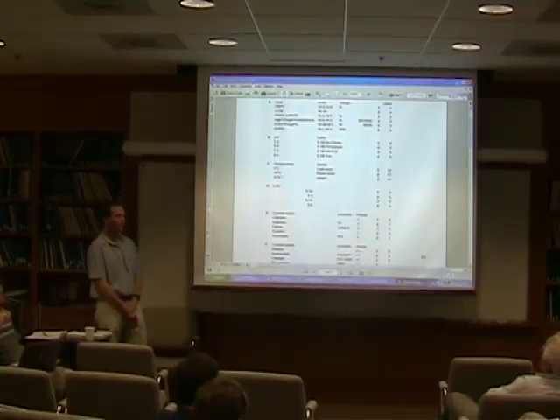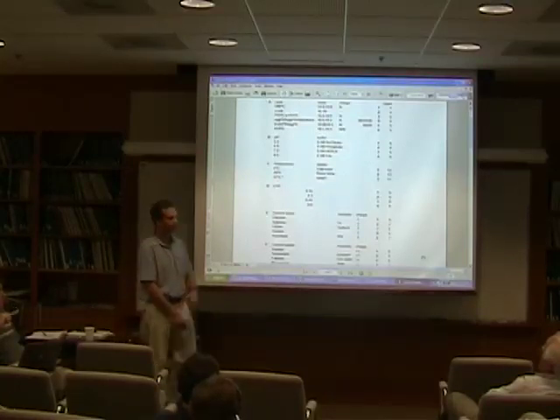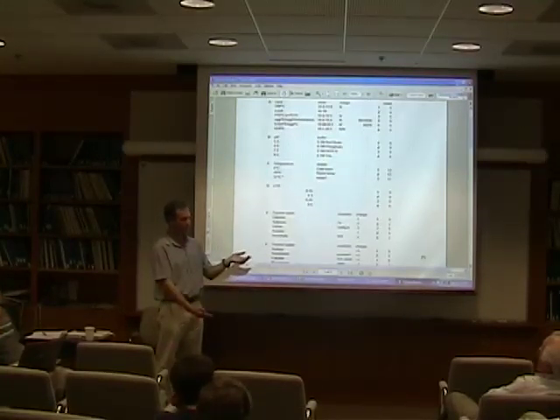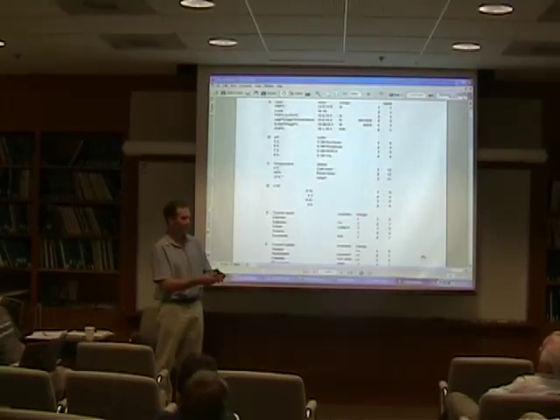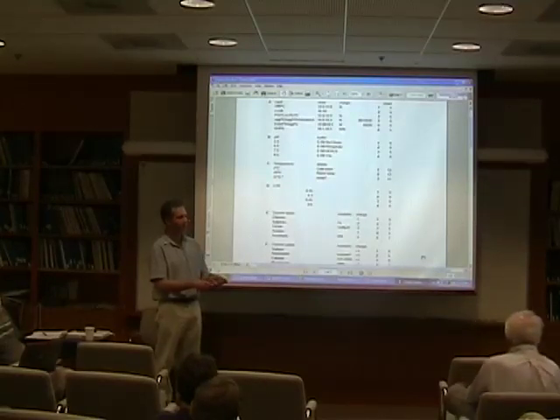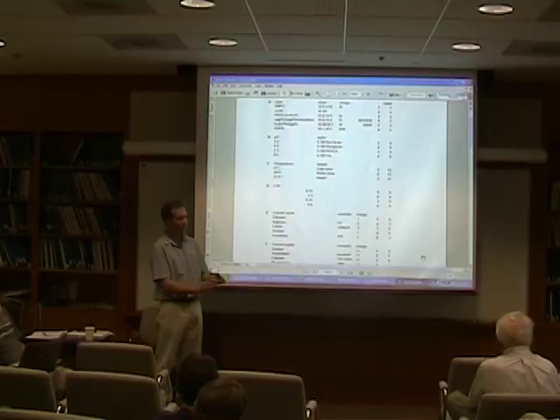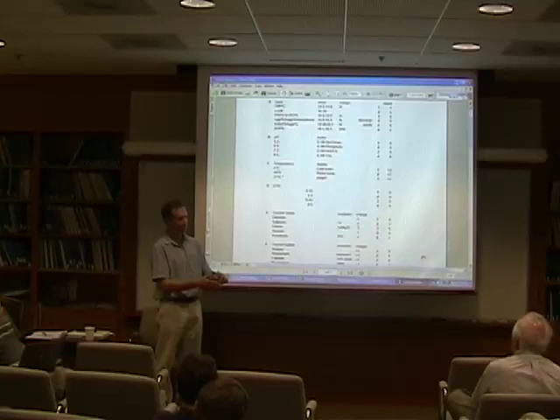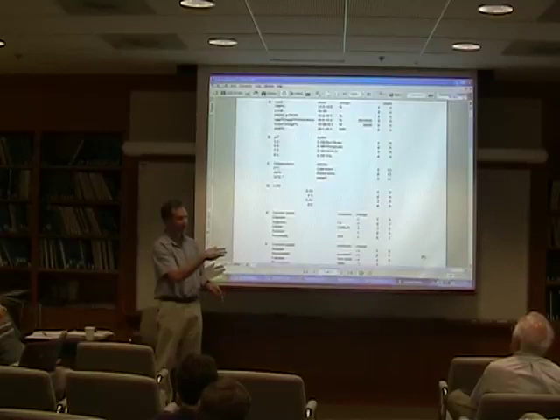But that would be nice for Pierre to do, right? In the scoring approach, which I showed this morning but didn't go into those details, you start off with soluble protein and the end is a good crystal, a total of 10 different steps. I took the point that getting a small mosaic crystal was more valuable than getting a large piece of crystal. So I've scored it so that crystallinity, anything that's got a crystal in it, is towards the high scoring end, based on size. And the things that form larger structures are better than small structures, along these lines. Which I think takes into consideration what you're saying.